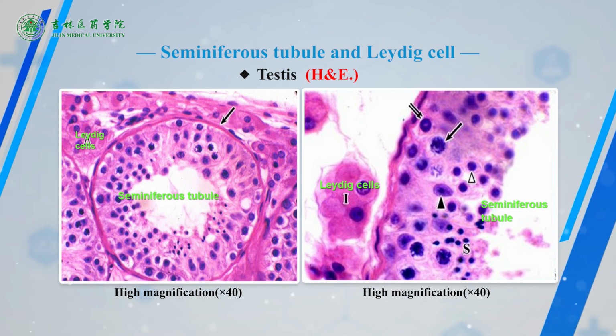Spermatozoa usually attach to Sertoli cells with their deeply blue-stained heads. It's usually hard to observe whole spermatozoa in one section, and only darkly stained, small flat nuclei can be identified, because their tails are thin and long, extending into the lumen of the tubules, and are always cut off. Look at its structure on the next slide.